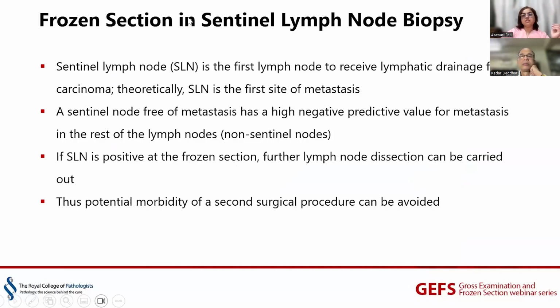So, sentinel lymph node biopsy, which is not common in the head and neck region, is the first node that receives the lymphatic drainage from the carcinoma. And here, the grossing of the sentinel node is very, very important, because otherwise we bisect the nodes or slice the nodes and submit them. But for a sentinel node, we don't want to miss even the smallest focus of metastatic tumor, because here, if we say the sentinel node is negative, the surgeon is not going to go for the rest of the nodal dissection. So our job is to identify the smallest metastatic focus in frozen.